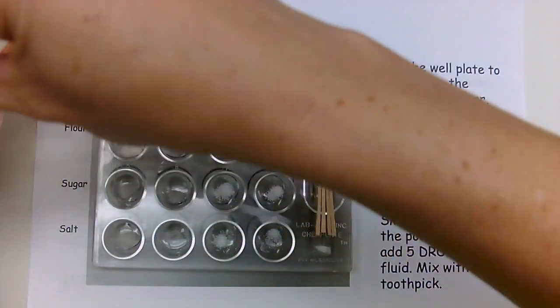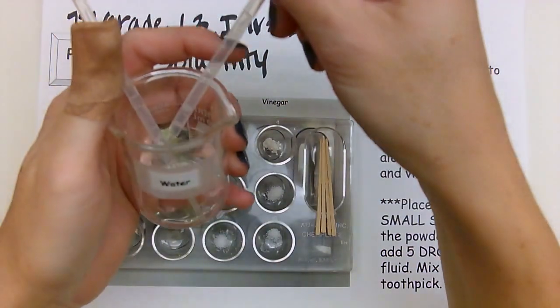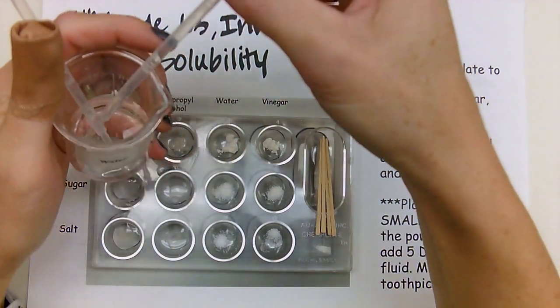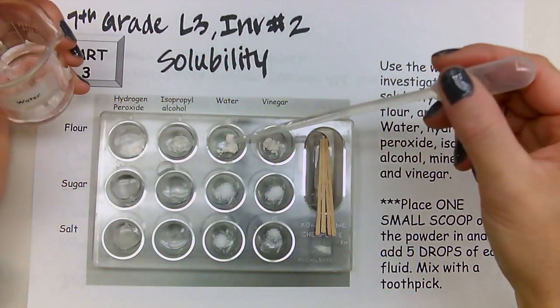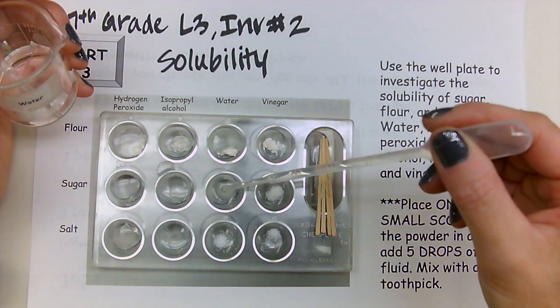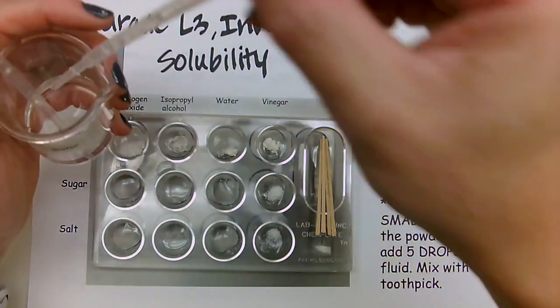Okay. Next is water. I have water here, this little guy. And you can suck it up into the pipette. 5 drops in each well.